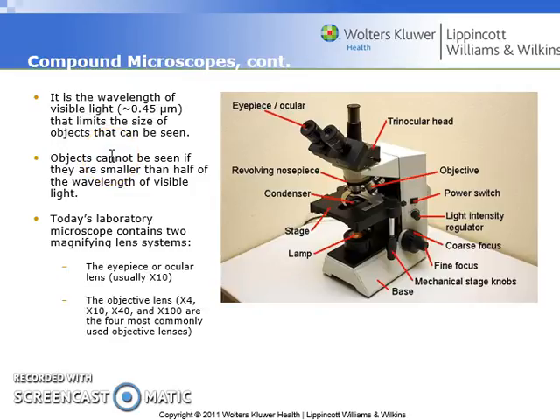because the way that we observe objects using the microscope is we essentially manipulate light as it's passing through the specimen. If you look down here on this microscope, this is called the illuminator, where it says lamp. Lamp, illuminator, those are the same things. Essentially you have a light source, and that light source is going to pass through the middle of this mechanical stage, and as it passes through, it's going to pass through something called the condenser. The condenser is going to help focus the light up through the specimen. There's no specimen on this particular slide, but most of you have seen a microscope slide with a specimen affixed to it. I'm hoping that you have.